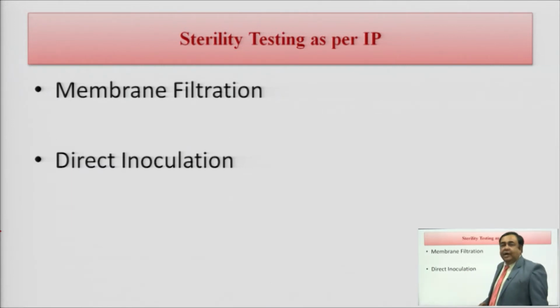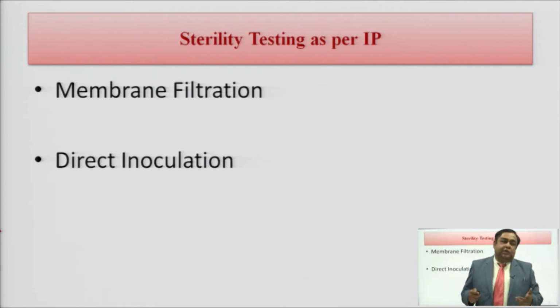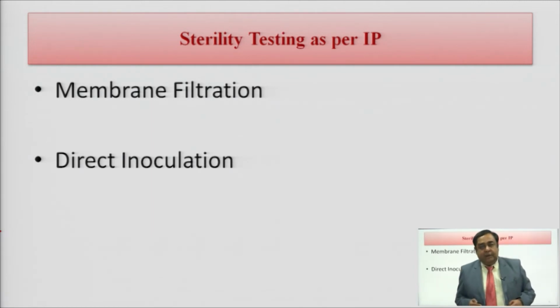On the other hand, in direct inoculation, you simply take the preparation, inoculate it into the media, and you see after incubation whether the media is turbid or not.